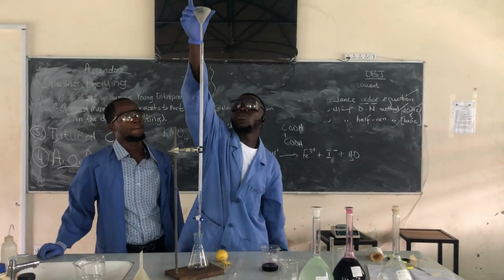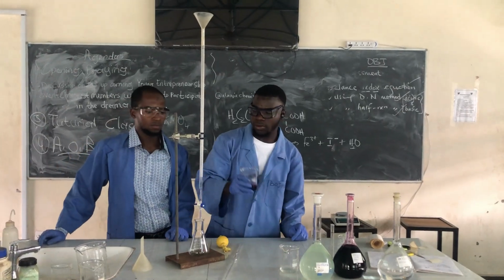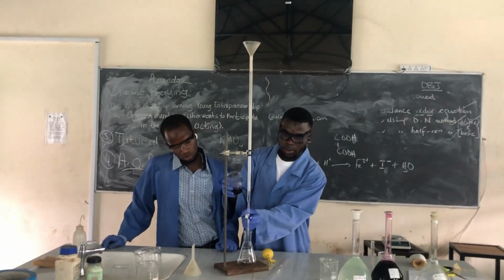Yes, so we are going to put the KMnO4 in the burette. First we have to check the tap, whether it is closed or open now.